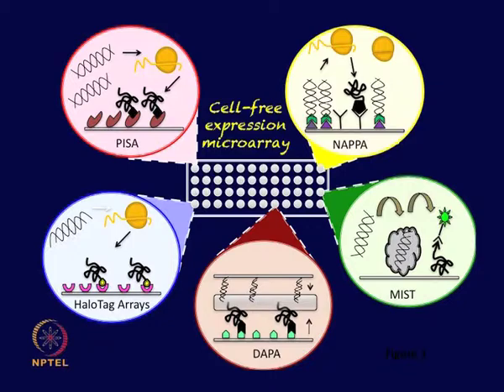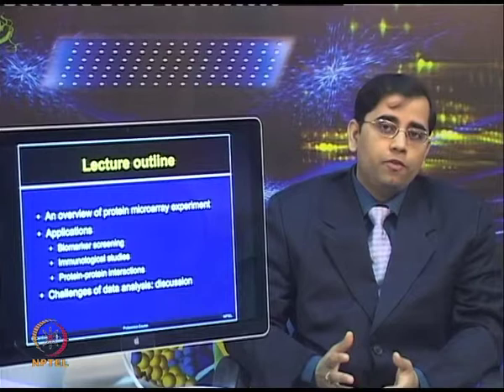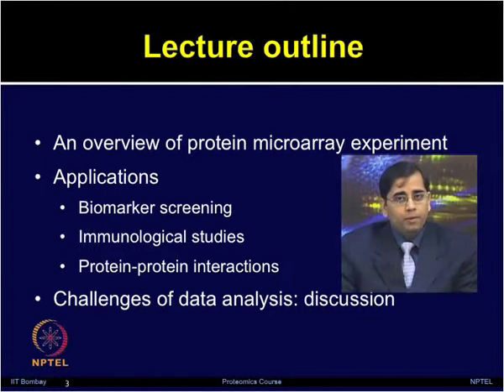So, in today's lecture, we will talk about an overview of a protein microarray experiment. First of all, I will give you a broad overview of how any type of protein microarray platform can be used for different types of applications. I will then describe a few applications very briefly by taking some case studies. This will just give you an idea of how these platforms are used for a wide variety of applications including biomarker screening, immunological studies, as well as protein-protein interactions.